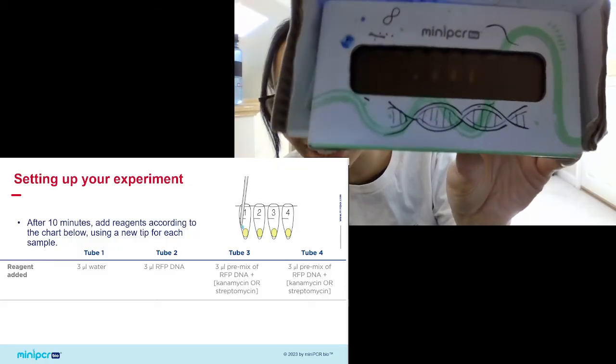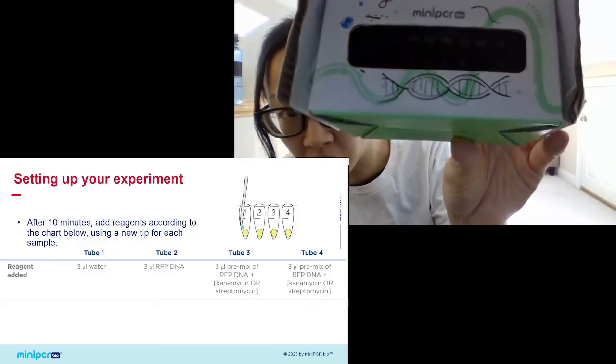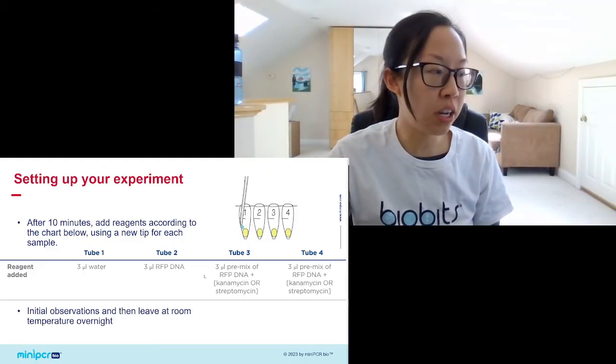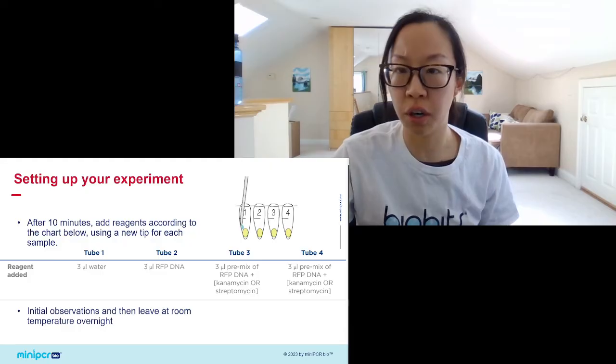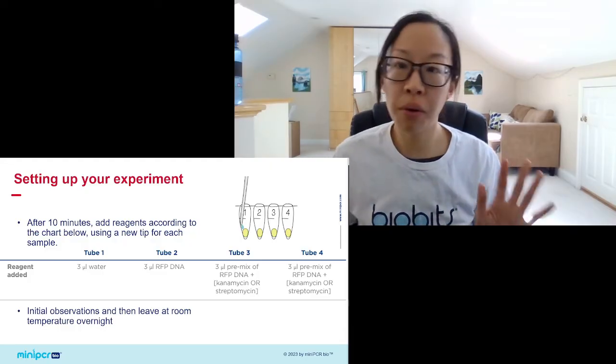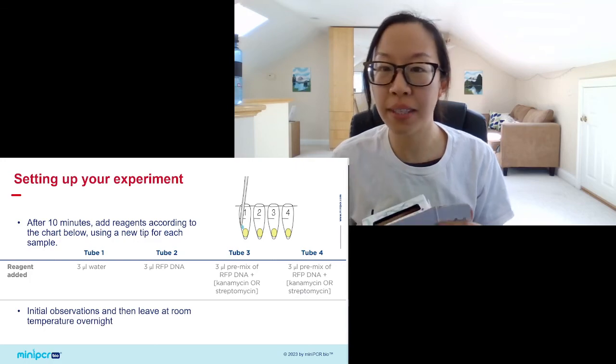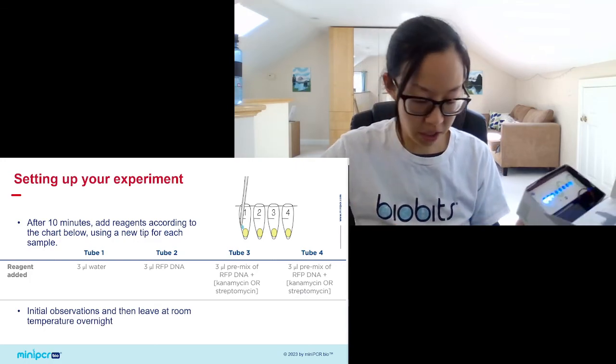However, right now you shouldn't see anything yet. Again, this is all just baseline. You'll get your final reaction after an overnight incubation at room temperature. Since you probably don't want to wait here with me until tomorrow, I'm just going to show you the tubes that I set up yesterday, cooking show style.